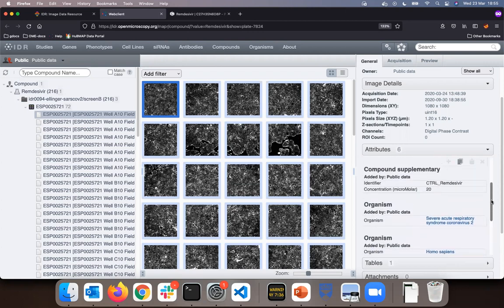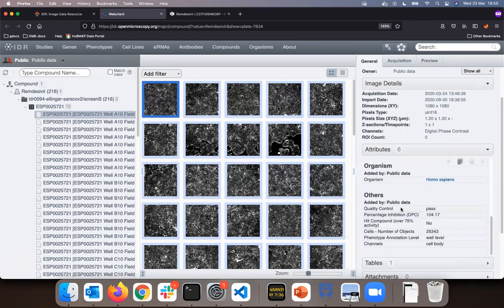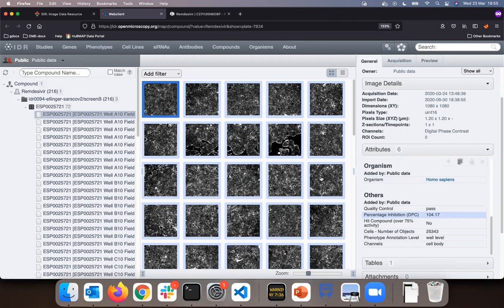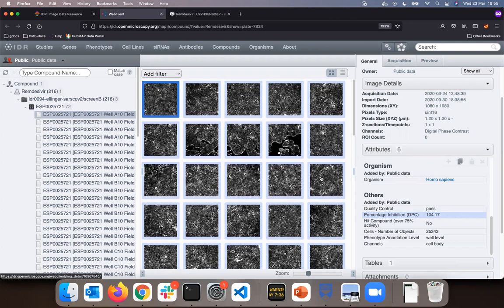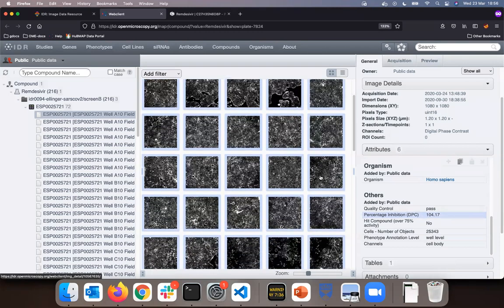This was measured at varying concentrations of Remdesivir, such as in this particular image it was 20 micromolar. The DPC is showing 104 for this image and this corresponds to an intact monolayer. This means that the relatively high number 104 is showing that the Remdesivir rescued the cells from SARS-CoV-2 quite well.